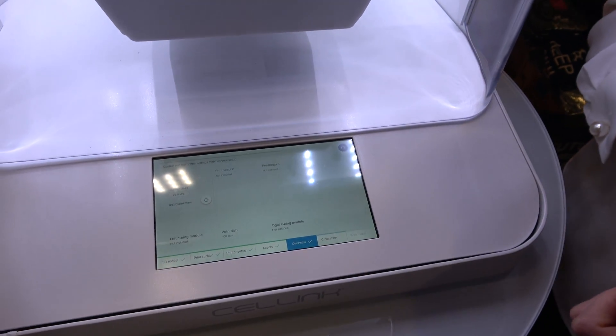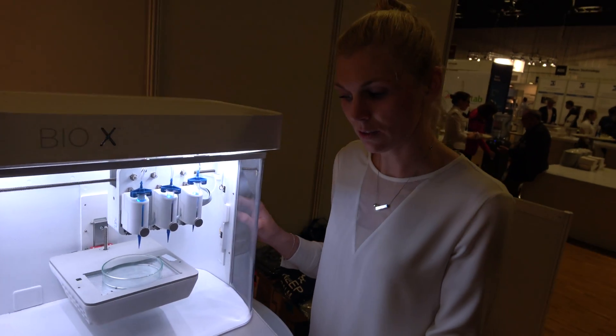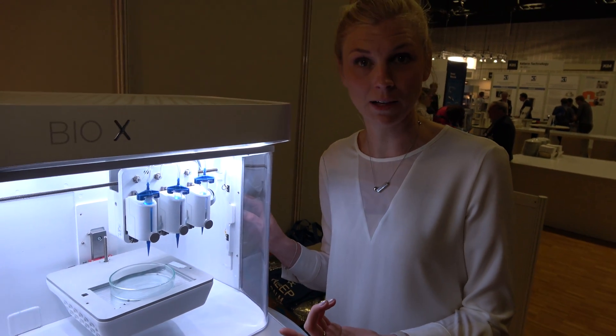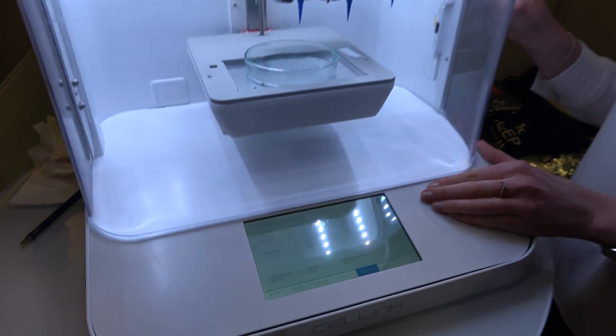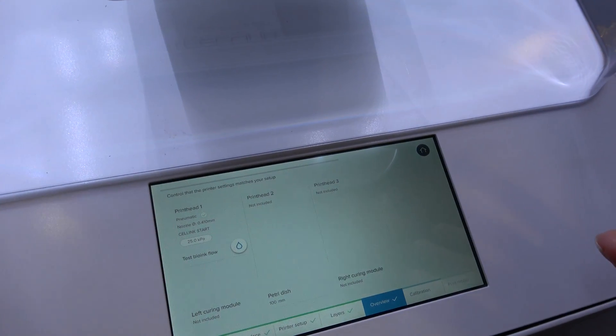The next step is the overview. Here you can see what settings you've entered and also test the flow of the bioink. So if you're printing with a new material, for example, it's possible to verify that you have the right pressure for the print.